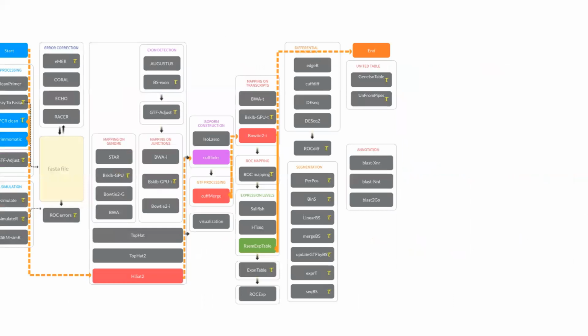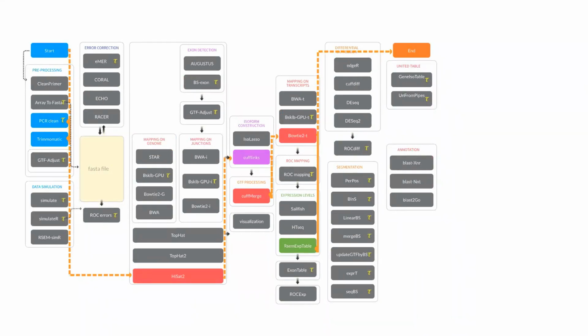In addition to the online courses, this program is designed to give you a sense of practical analysis tools. And we want to make this as approachable and as useful for a wide variety of participants, both those that do have some technical background like coding and those that do not. But most importantly, we're going to be analyzing big data sets. So these are going to be tens of samples at a time. As you know, a single sample of RNA-seq data could range anywhere between hundreds of megabytes to a number of gigabytes. And so processing such data sets on your own computer is going to be time-consuming and ineffective.